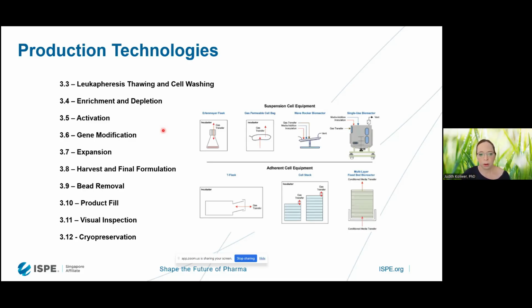When it comes to non-viral modifications, again, we have discussed a few of the different programs. For example, when it comes to electroporation, of course, we have the dedicated tabletop equipment that we use for our electroporation. And we have made a few discussions around what really makes a difference there, but the basic parameters we have found are pretty much always the same. Again, it's more a matter of the volume that we are working in.